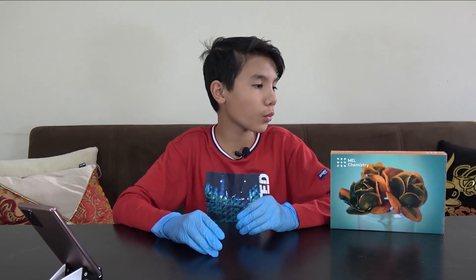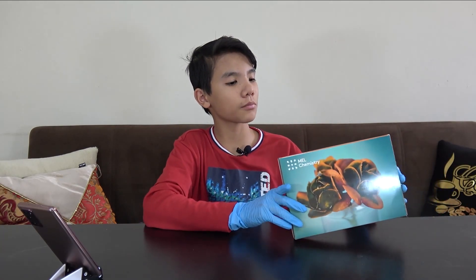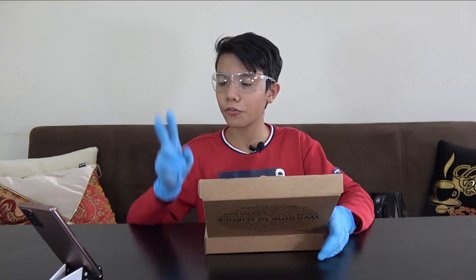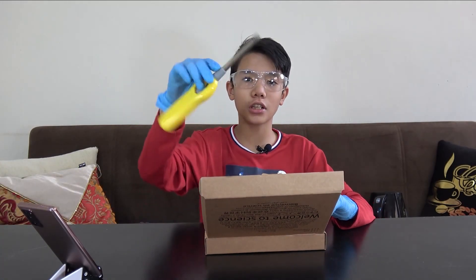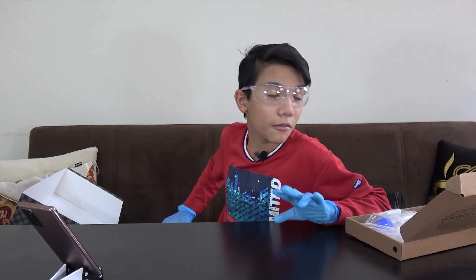Assalamu alaikum warahmatullahi wabarakatuh, and welcome to the second experiment of the chemistry box — Taming Acid Rain. The second experiment we're going to be doing is called Sulfur Dioxide. First, things we want to prepare in advance, which are not included in this box, are just some water and matches. If you don't have matches, a lighter will work just fine.